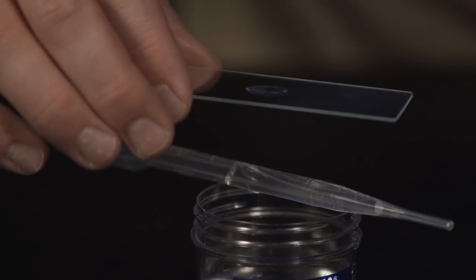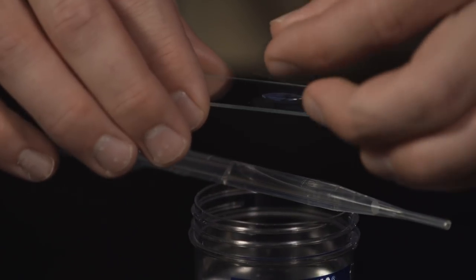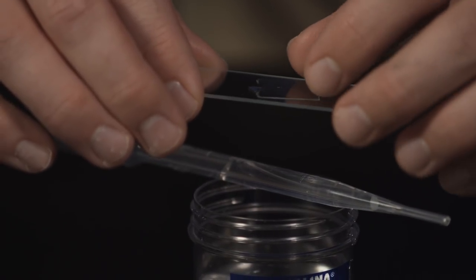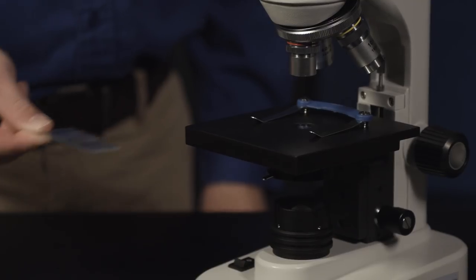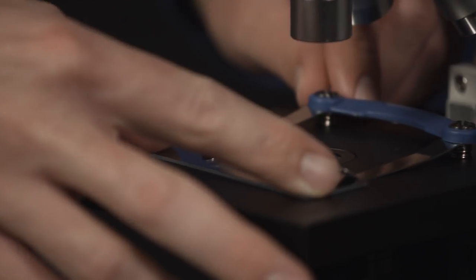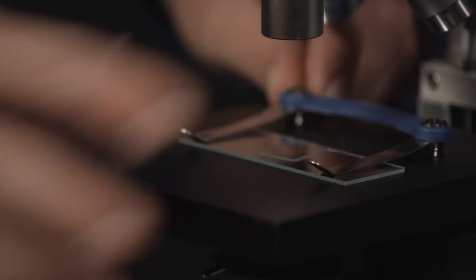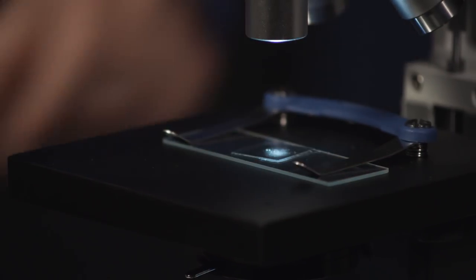Now you can take your slide and view amoeba up close using a compound microscope. Set your microscope onto the lowest power objective and place the slide onto the stage. Locate your amoeba using the lowest power objective.